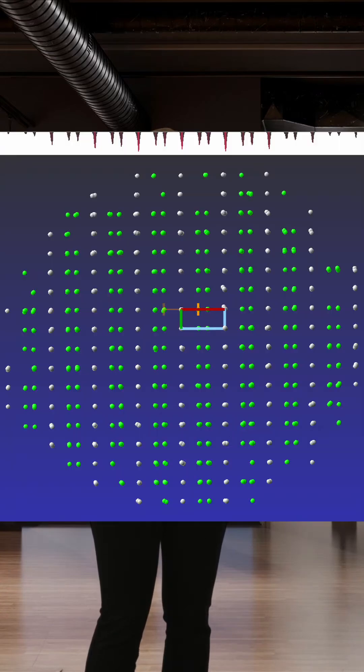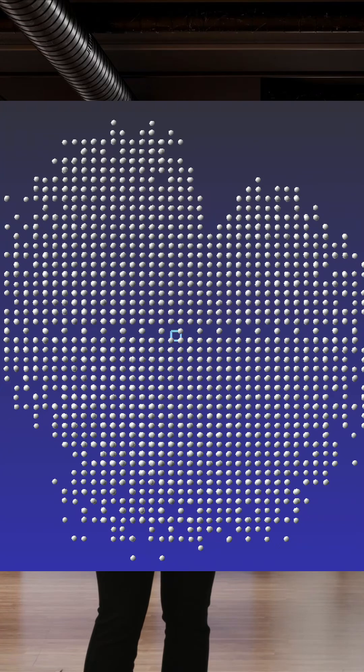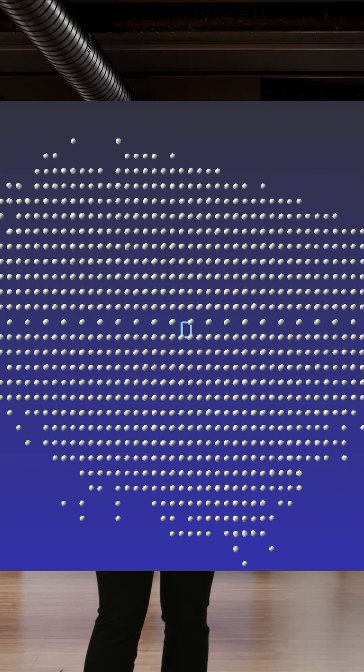You can also determine if your structure is modulated and find your Q vector. If you have a unit cell selected, you can look down A star, B star, and C star to see how well your reflections fit that cell. And you might even see some systematic absences.